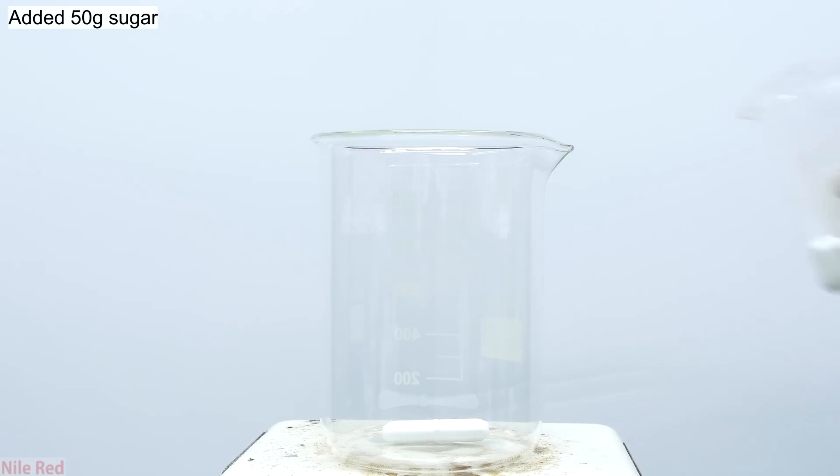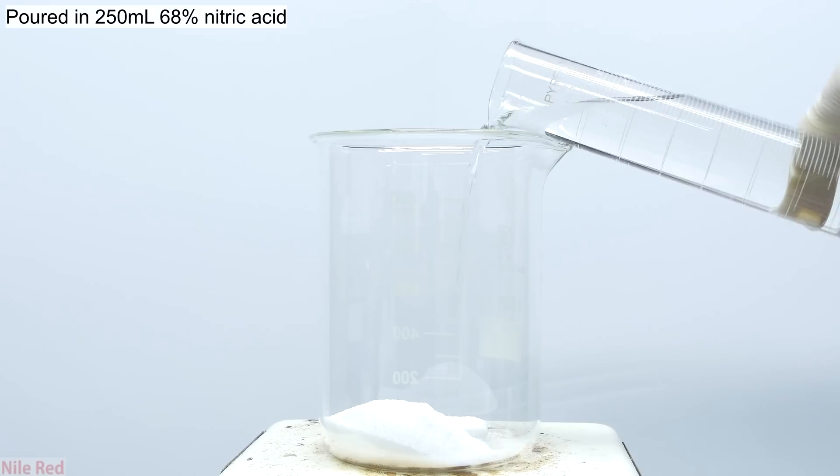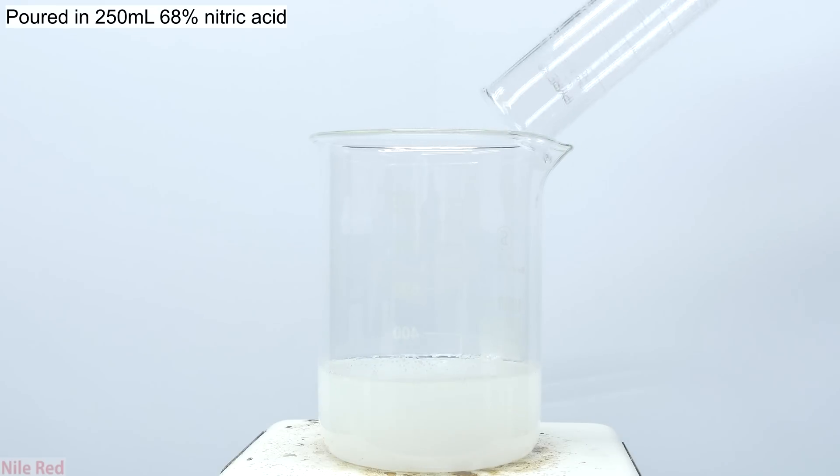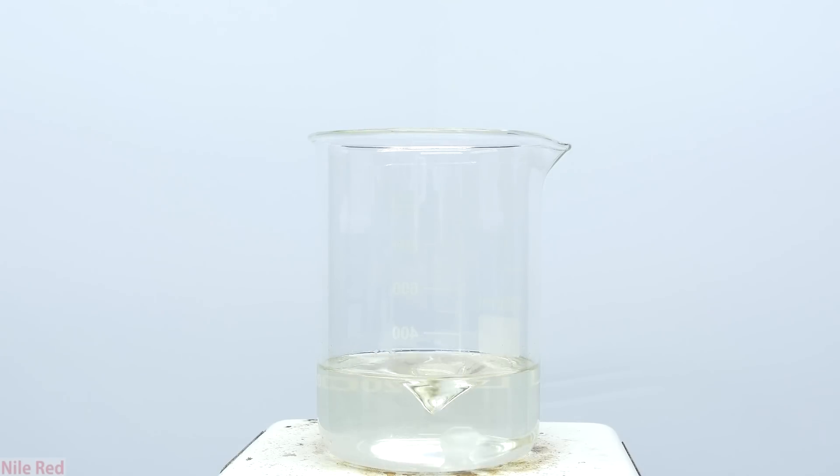I start off by adding about 50 grams of sugar to a 1 liter beaker that already has a stir bar in it. Directly to the sugar, I then pour in about 250 milliliters of concentrated nitric acid. I then turn on the stir plate and I let things mix until all of the sugar has fully dissolved.